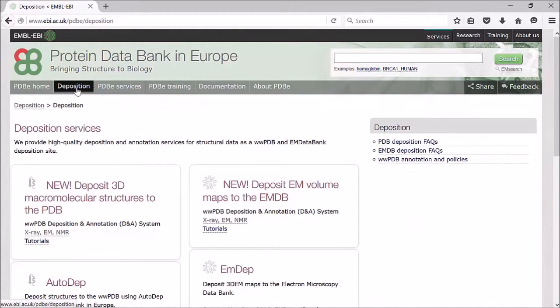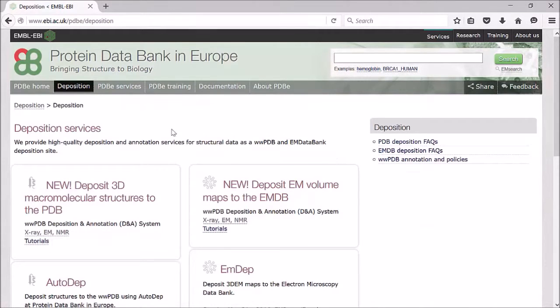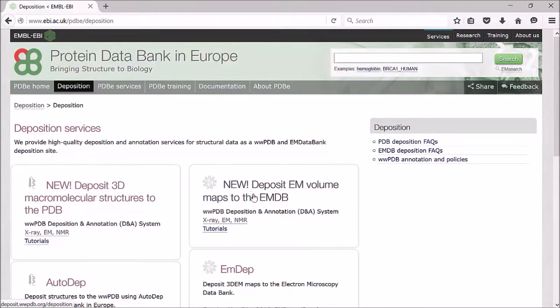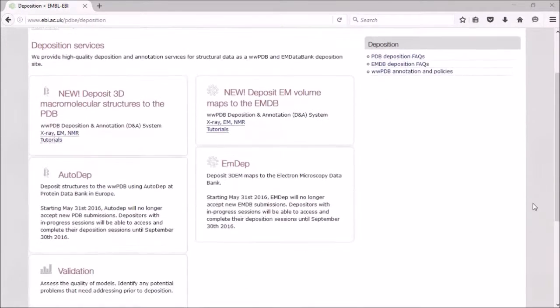This takes you through to our deposition services. As you can see, the two links at the top have 'new' next to them because we have a new deposition system which is now common to both PDB, the Protein Data Bank, and the EMDB, the Electron Microscopy Data Bank. These are all now dealt with a common system.